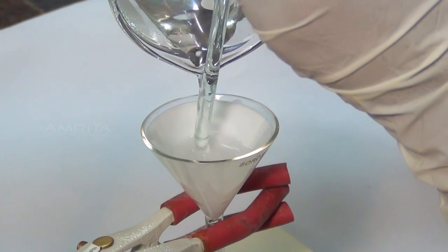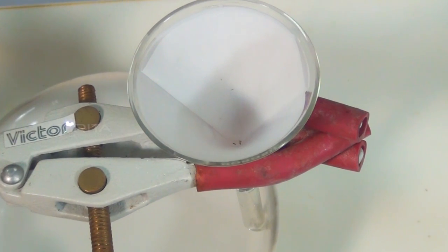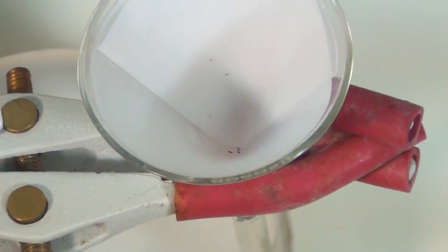Pour the solution into the funnel over the glass rod and collect the filtrate in the china dish. The insoluble impurities are left on the filter paper.